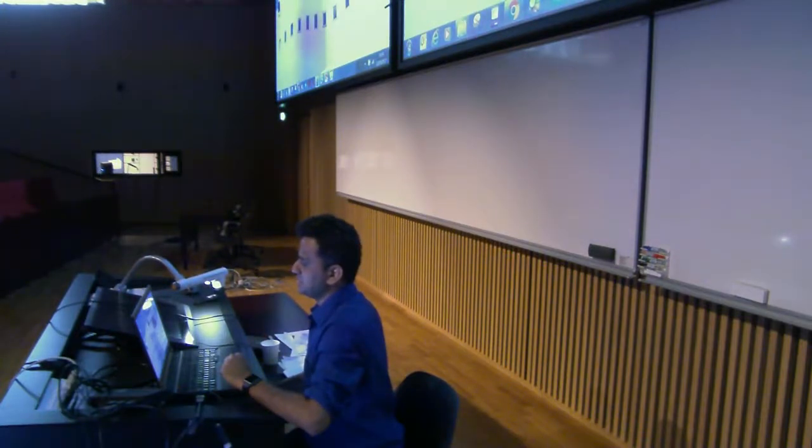It is also possible to actually fill up the region of interest. So maybe if I just want to fill a different color, edit, and you say fill. Now it will be filled. That's it. You can make a text actually.